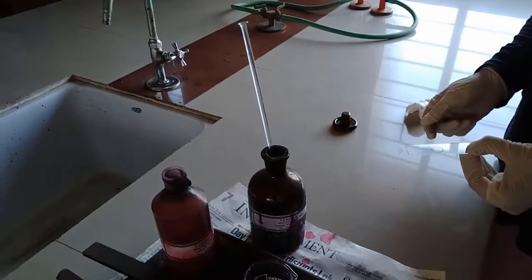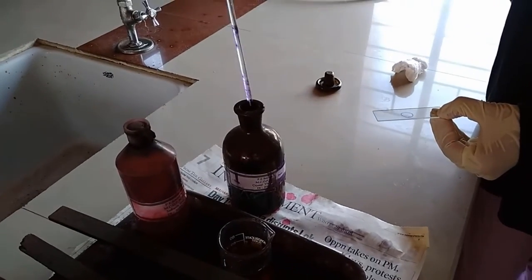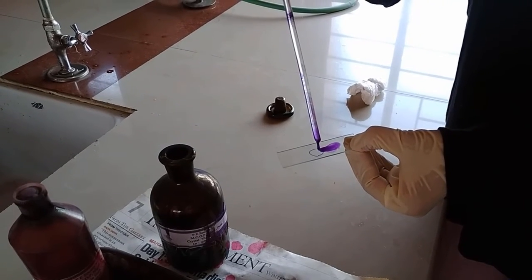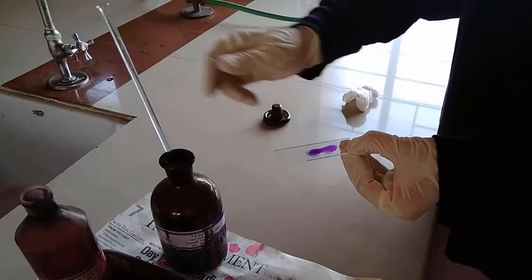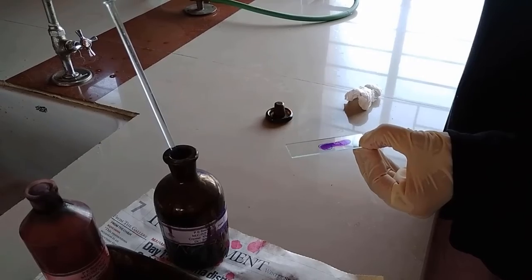We will be adding the primary stain, which is crystal violet. We will be adding 2 to 3 drops of this crystal violet in the marked area. And allow it to stain for say 1 minute.